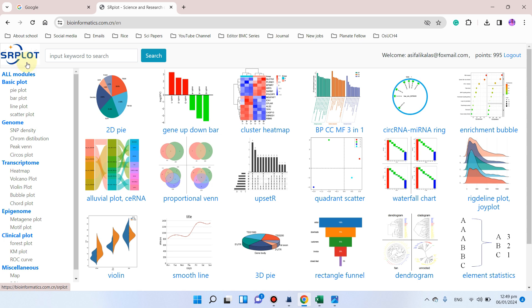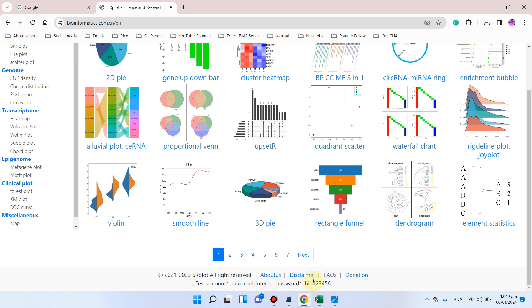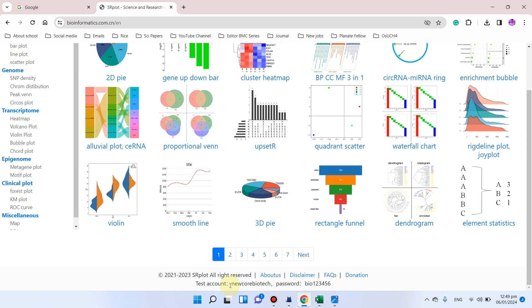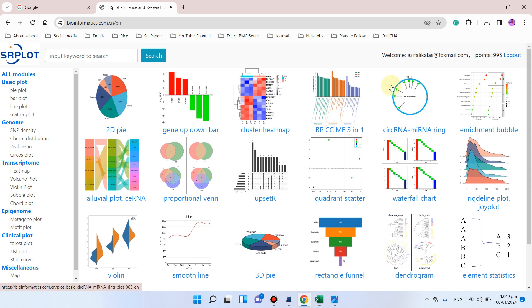To draw principal component analysis, we can simply input our keywords to search for any required graph. Before that, you must log in to this website. Creating an account is totally free, so I recommend you register yourself. If you don't want to register, you can use the provided test account login and password, but it would be better to create your own.